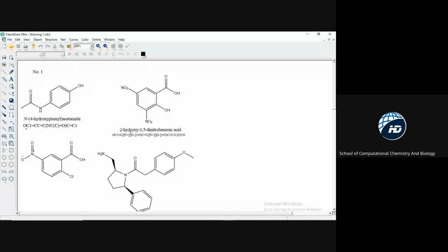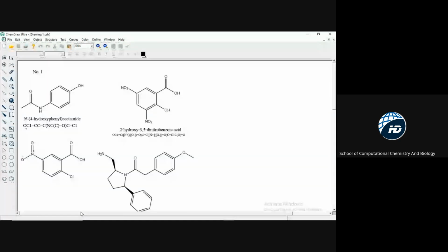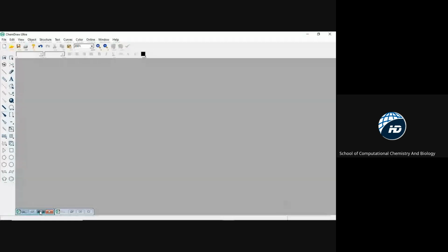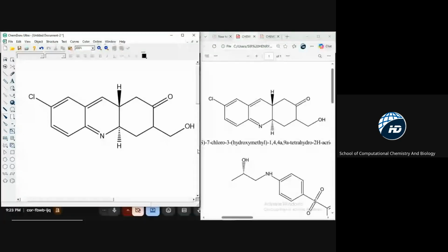Yes. So once you save the first one, it will not automatically save the second document. That one is a different document on its own. So I can go back to it by minimizing this one. Then I'll come to the second one and maximize the second one. All right. So when I'm done with this page too, I will also save it. So are we together?